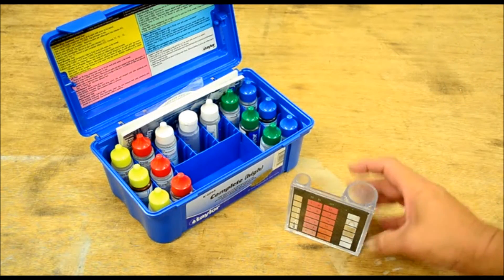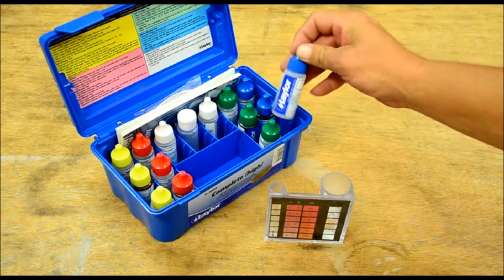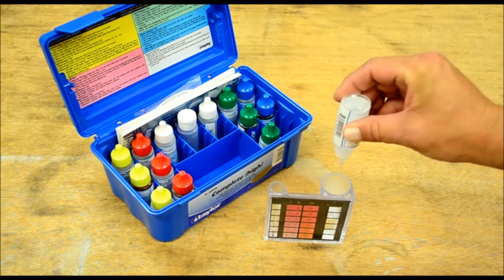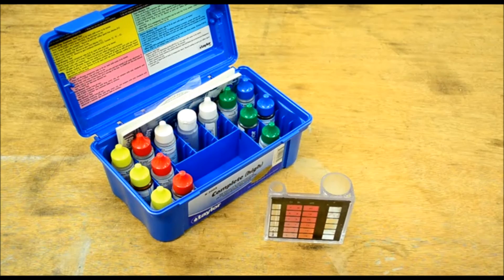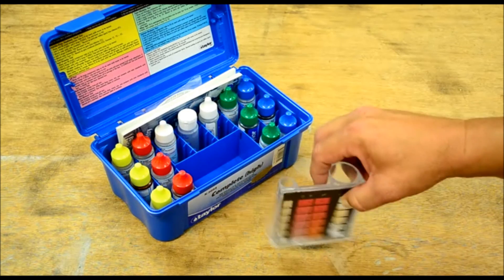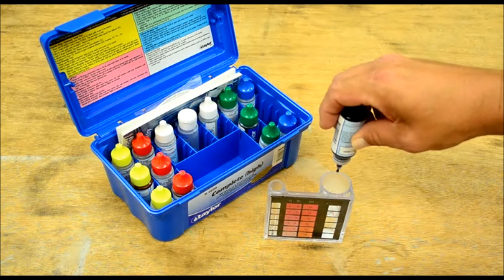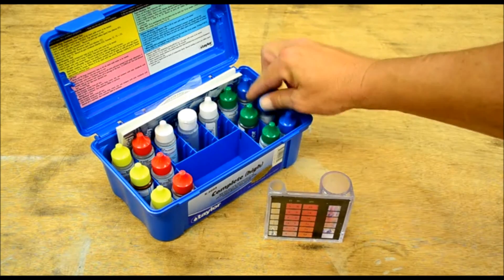All right, calcium hardness — it's basically the same setup. Fill your large test vial to the 25 milliliter mark. Take reagent number ten and add 20 drops, then swirl that to mix. Next we're going to take reagent number 11 and add five drops of that, then swirl to mix.